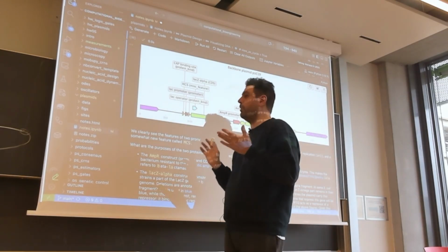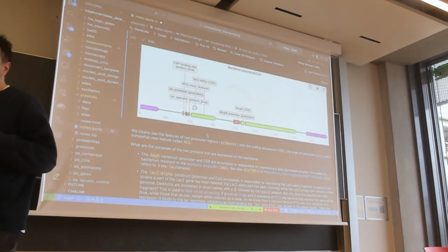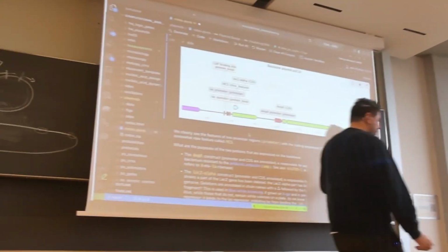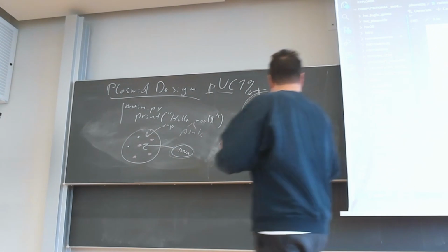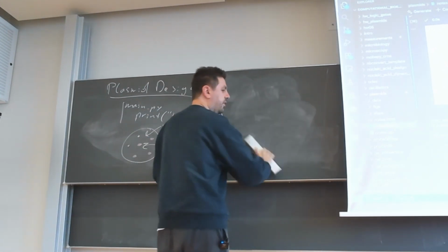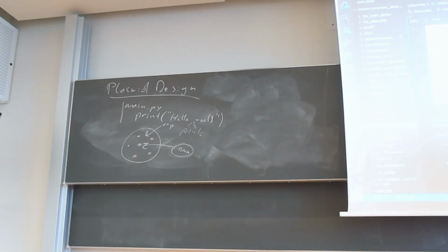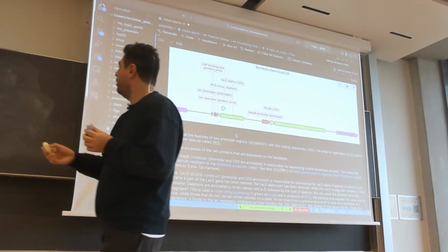So why would you do that? I mean, this is very strange. And I can perhaps draw something here. So this will be a really nice feature, also why we chose this plasmid. It allows you to do something which is called blue-white screening. And that means the following.